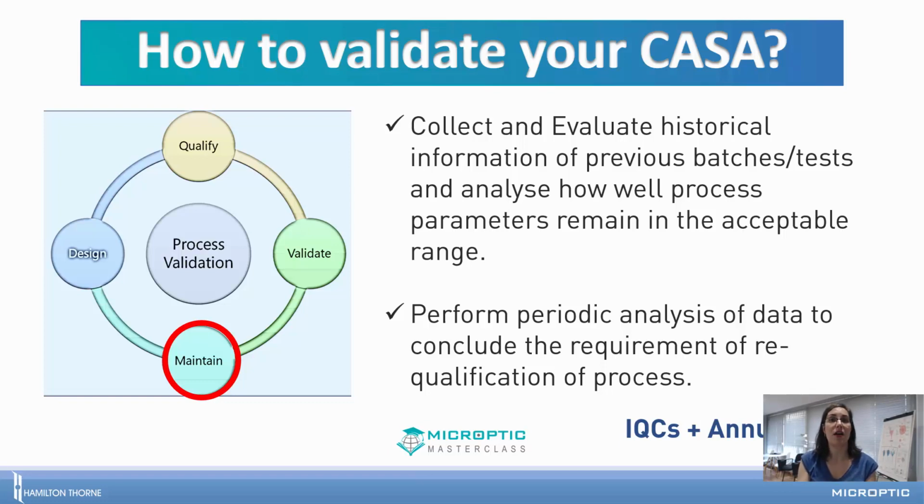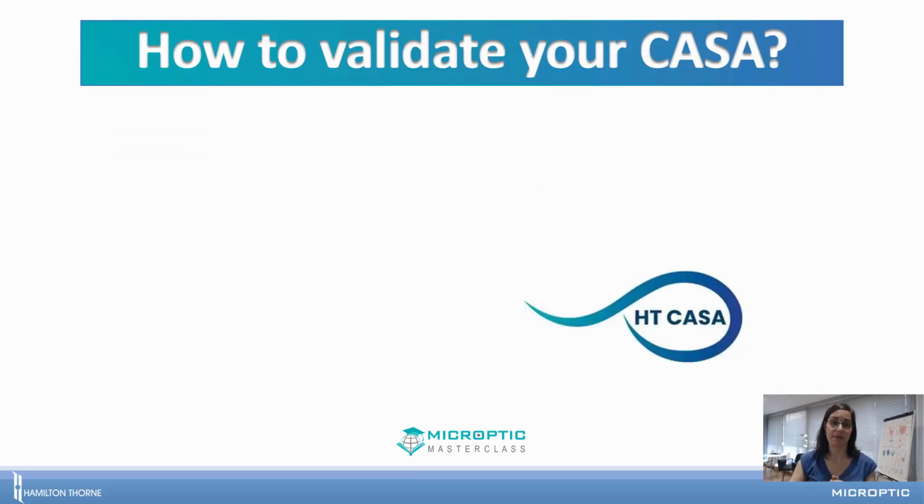You need to give evidence that the system is working as expected with the passage of time.